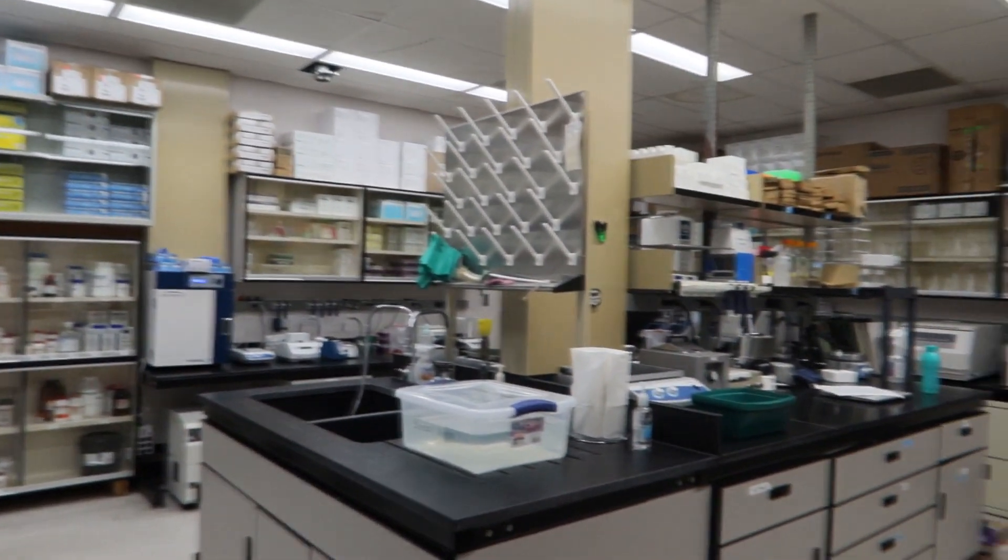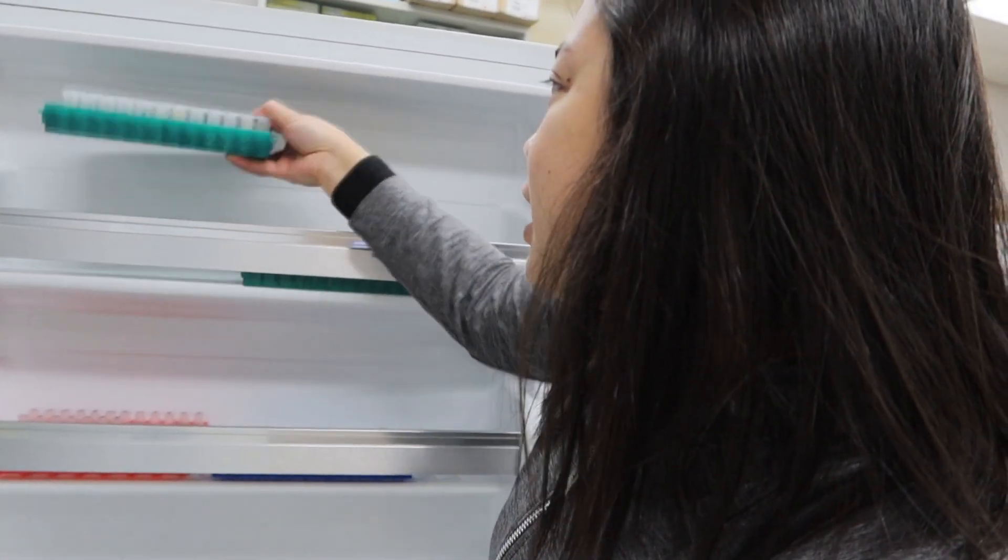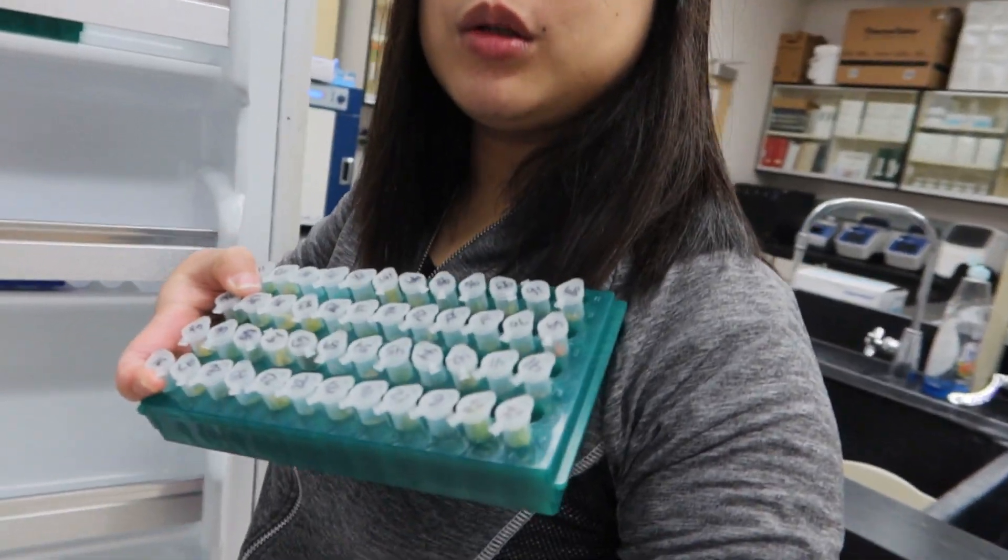Inom na tayong tubig kasi grabe na kadehydrate yung lamig. So today, mag-extract tayo ng DNA. Alam kong common na to sa mga taong pro na sa mga gantong bagay. Kailangan ko matapos at least itong 48 tubes.